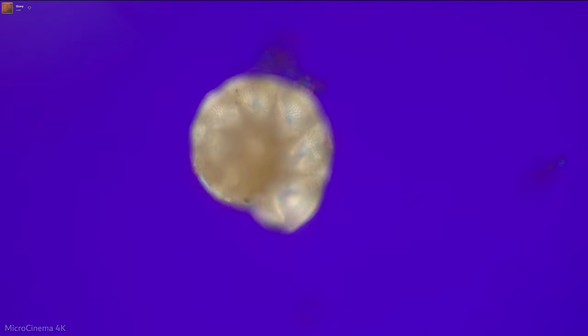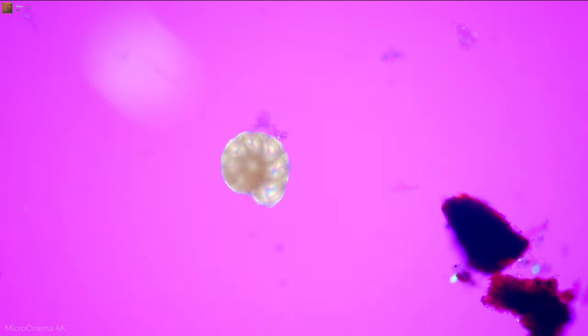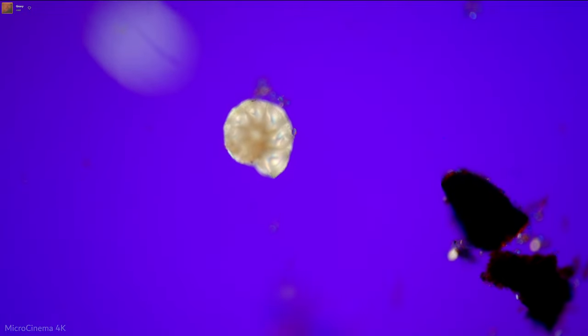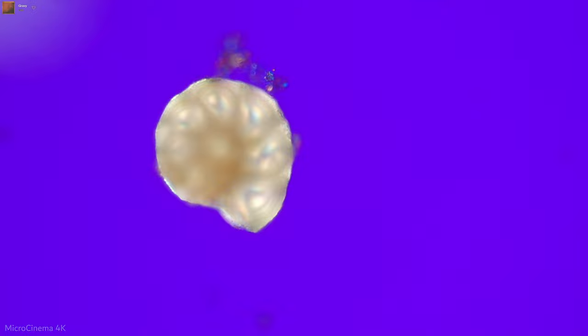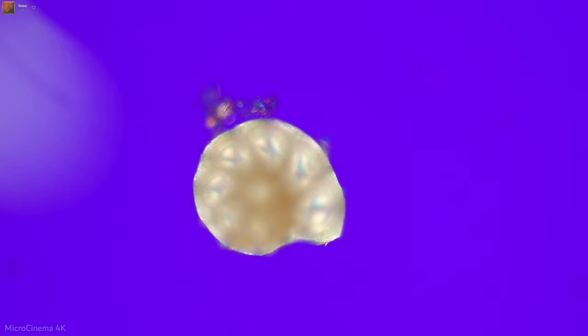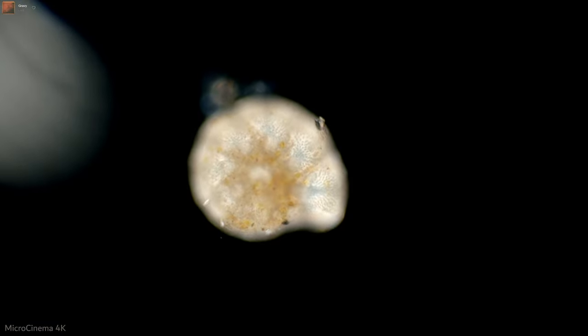Interesting, not a whole lot. What would that mean? I'm not really an expert on investigating all the little things that can happen when you shoot something in polarized light. It's definitely birefringent, but it's almost like it's got no directional component to its birefringence, which would be weird. It doesn't really make sense, but I'm sure there's a reasonable explanation for this. It's crazy though. It really looks just like Darkfield.